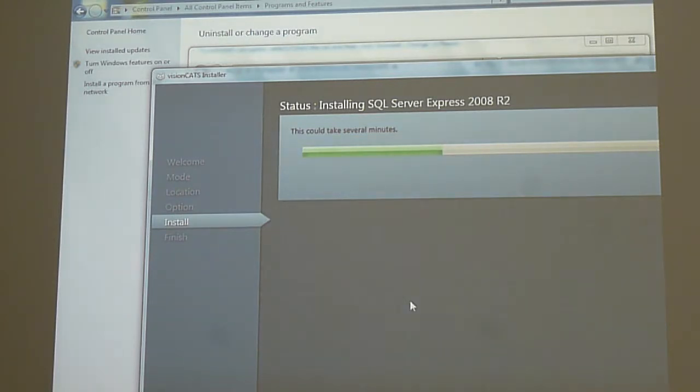And with that, almost all files and information that was on the computer are gone. Except I have a backup. The backup. Only the backup. If you have to do something like that, always make sure that you really made a backup. In the United States, again, the customer with this 19,000 data, I really go back to this a lot because he did a lot of strange things.